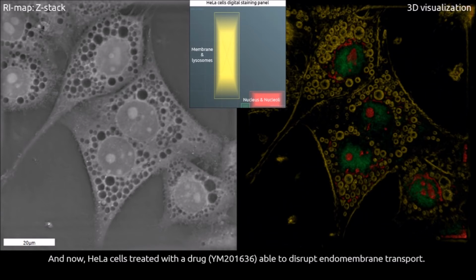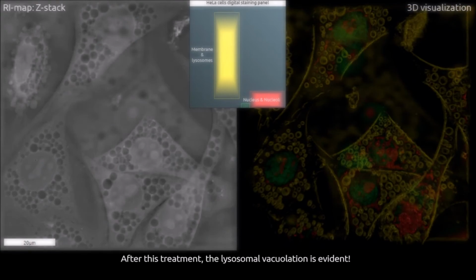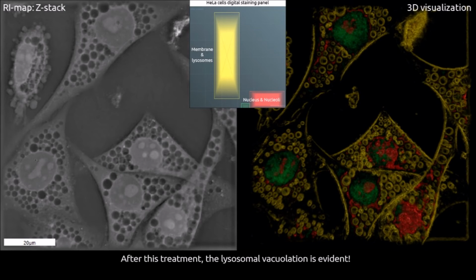And now, HeLa cells treated with a drug able to disrupt endomembrane transport. After this treatment, the lysosome vacuolation is evident.